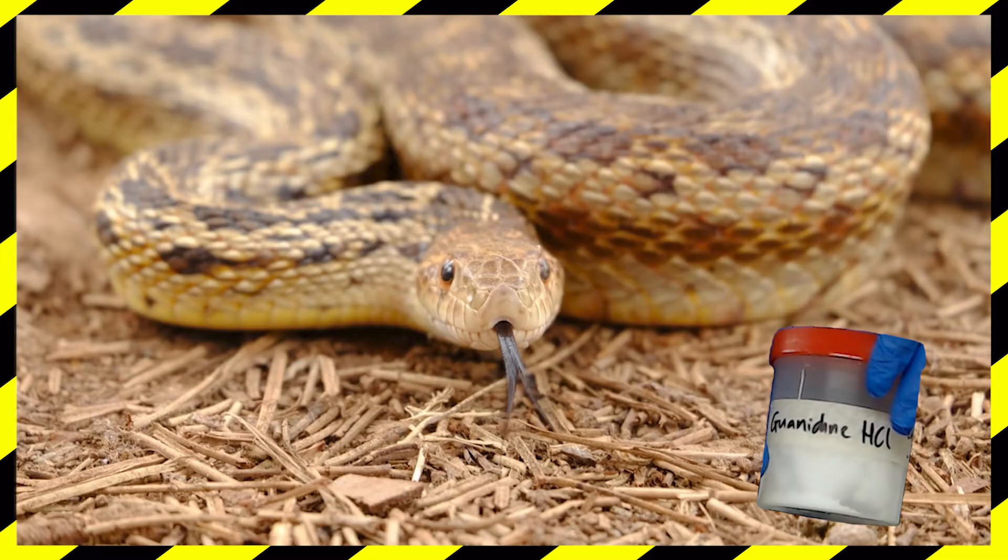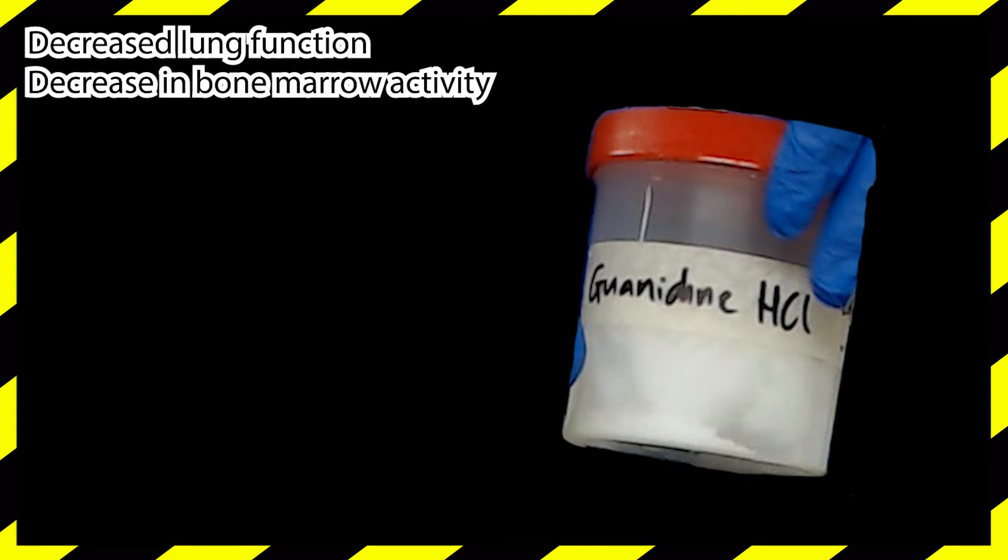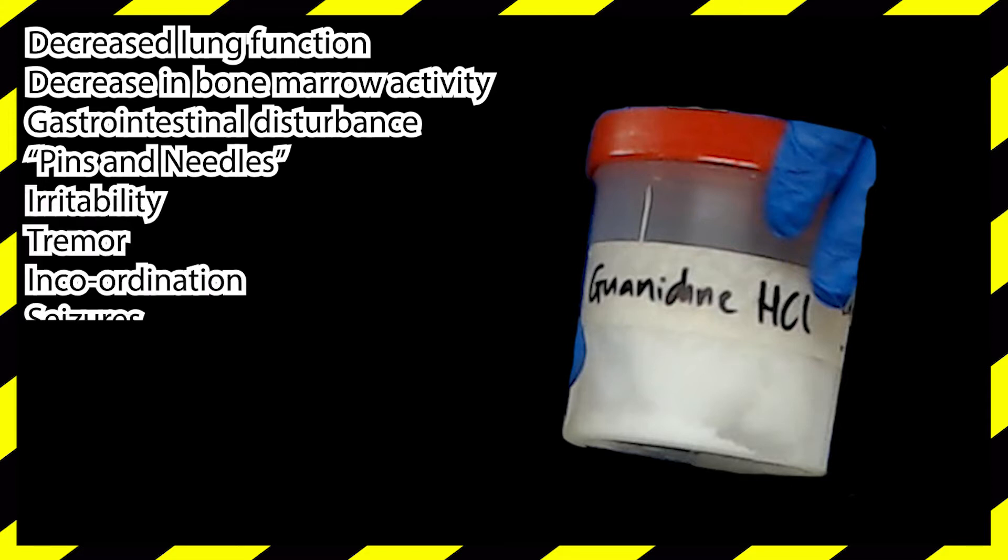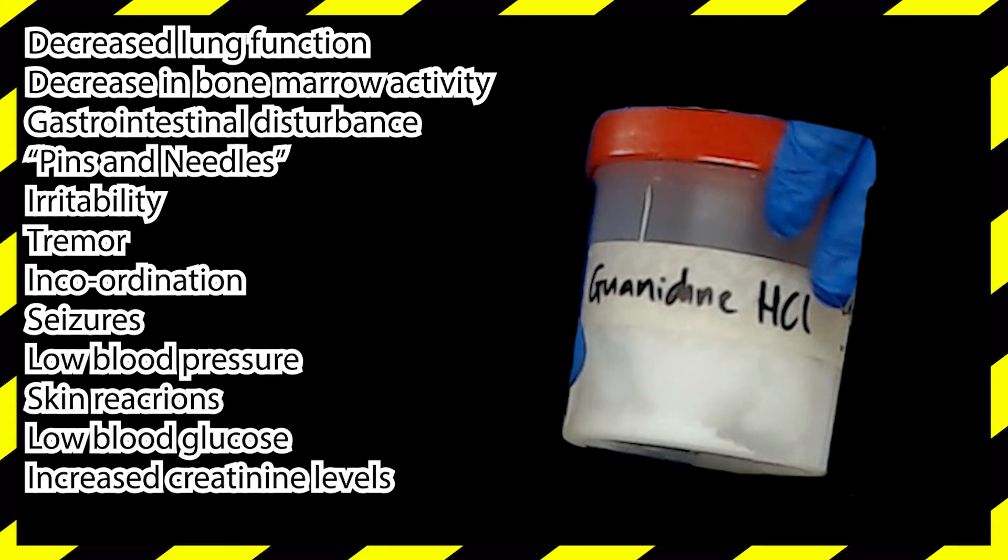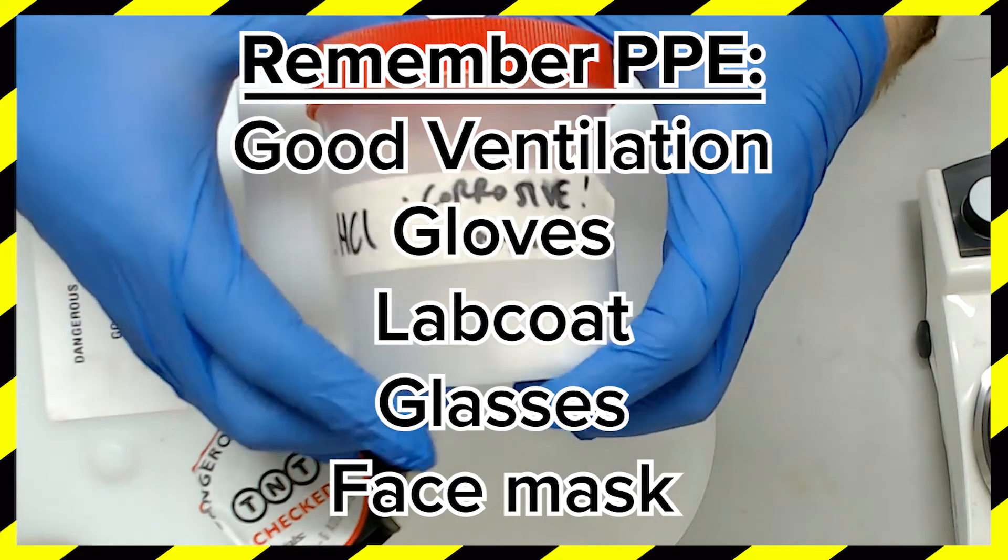I'm not going to repeat my rant from the last video about how truly nasty guanidine hydrochloride is, so let's focus on the long-term health effects of exposure instead. Decreased lung function? Okay, that's not good, but let's check out the next sentence from the MSDS. Guanidine hydrochloride causes decrease in bone marrow activity, usually shown as gastrointestinal disturbance and pins and needles in the lips, face and extremities. Irritability, tremor, incoordination and seizures can occur. Rarely there is low blood pressure, skin reactions, low blood glucose and increased levels of creatinine. Chronic exposure may cause kidney damage. Hey, are you still there or have I scared you away? Put your PPE on and get to work. Use proper safety, unless you want to be a martyr to science like our blessed Marie.